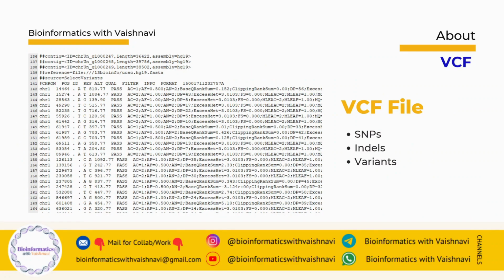Finally, we have VCF. Once reads are aligned, we compare the sample with the reference genome and look for differences. Those differences, like SNPs or insertions and deletions, are stored in the VCF file.